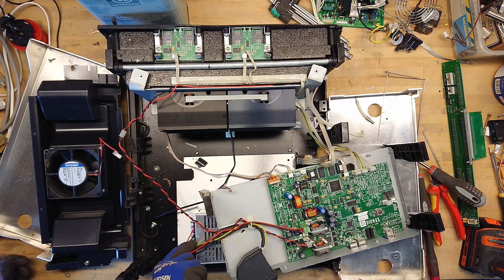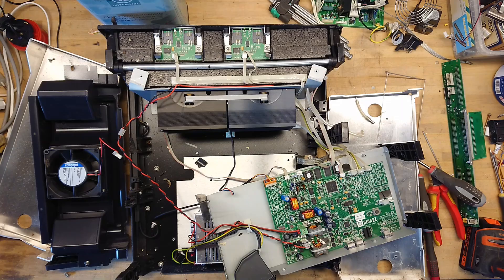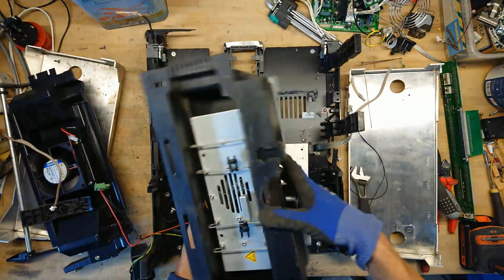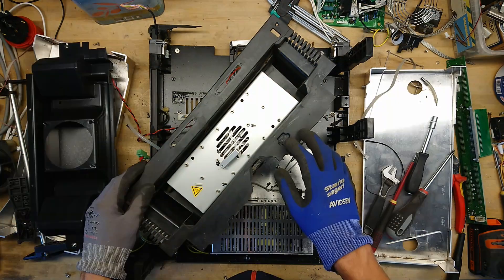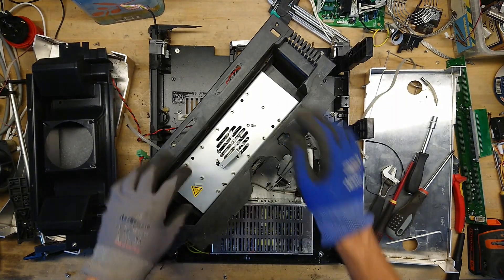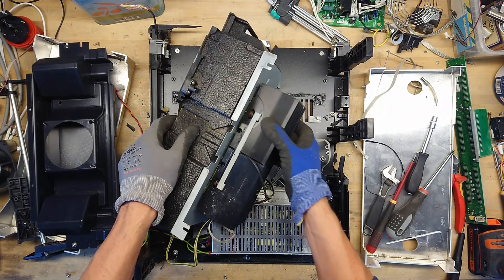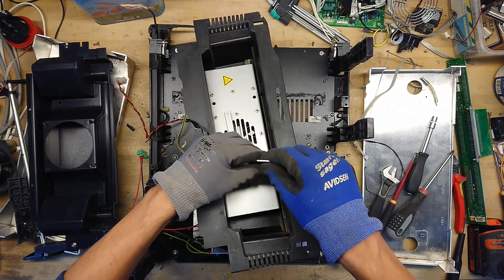Before doing that, let's check out the power supply underneath here. It's a Meanwell SP150-24 — a 150 watt, 24 volt DC power supply. That's nice; it can always be reused. It felt like I dismounted the whole thing with four large screws that went all the way through the whole construction, so I assumed it would come apart, but one screw is maybe still stuck in there.